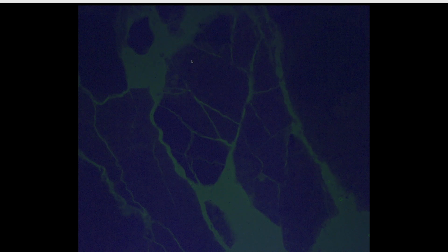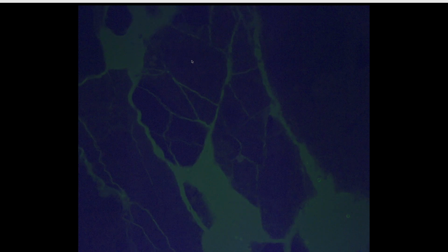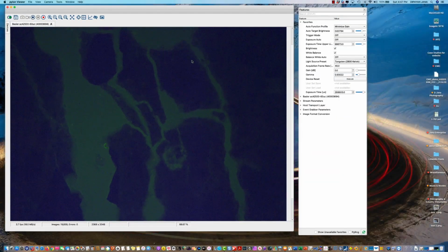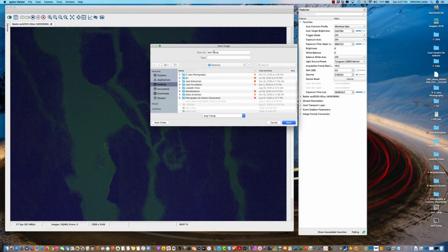A low viscosity epoxy is used, about 100 to 110, 150 centipoise viscosity, and you mix the fluorescent dye with that low viscosity epoxy, and then use that dye mixed epoxy to impregnate the sample before preparation of thin section. And at any position, if you want to capture an image, Command S, then that will capture an image.